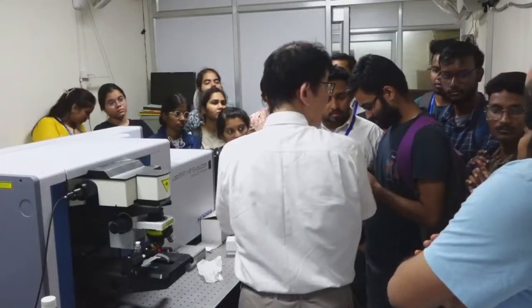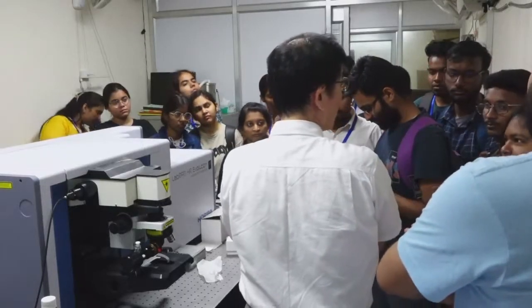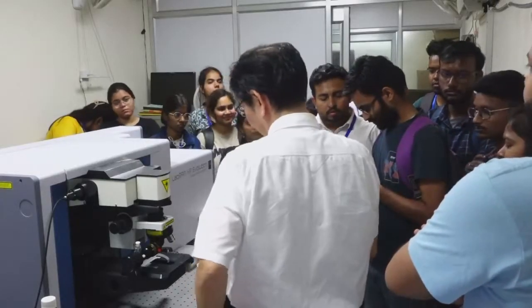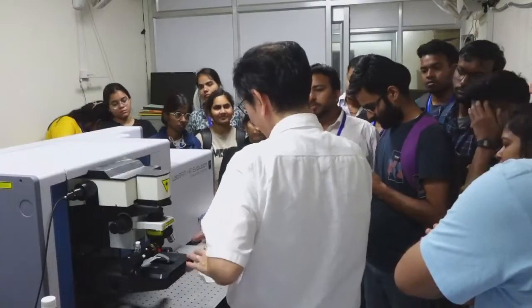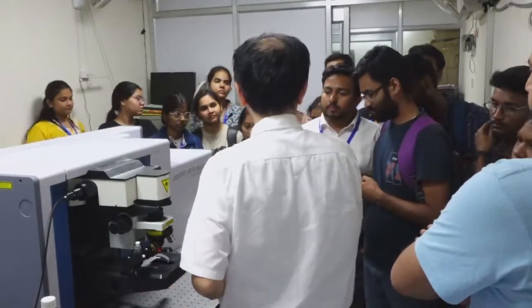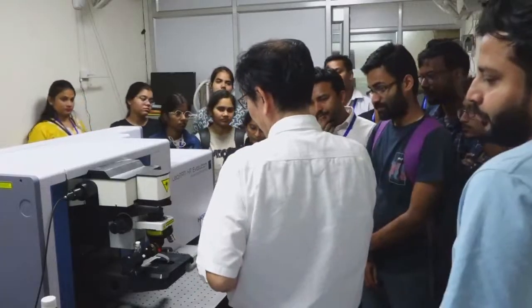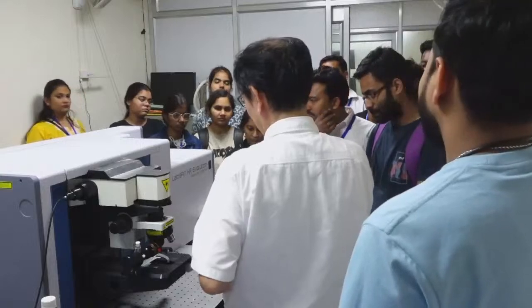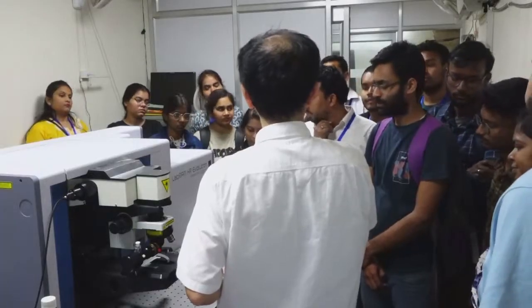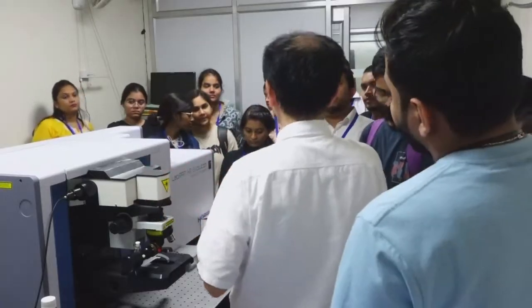It uses some types of nanoparticles, composite nanoparticles, silver coated nanoparticles. Probably by adding some fabrication at the sample point, additional experiments would be possible. But at present, it may not be possible. So it depends. The instruments should be customized for your purpose.